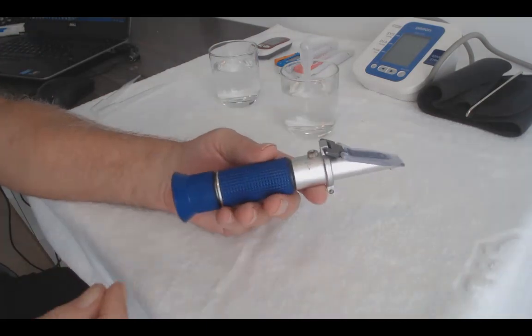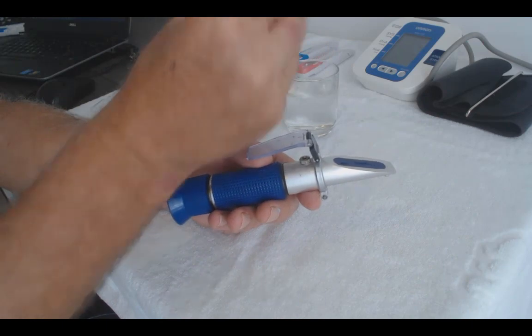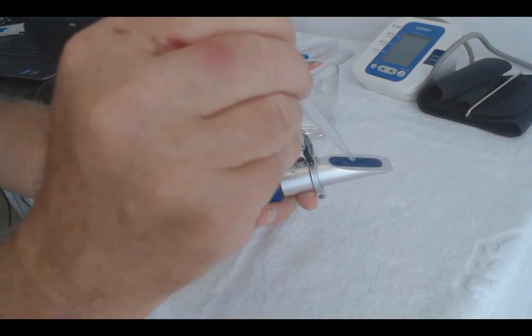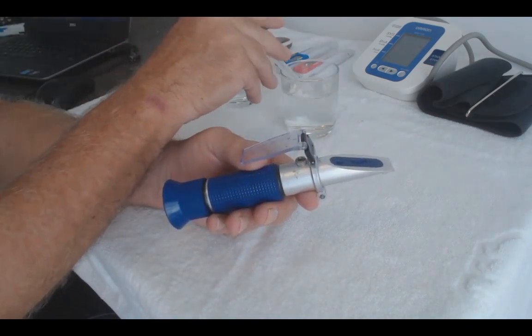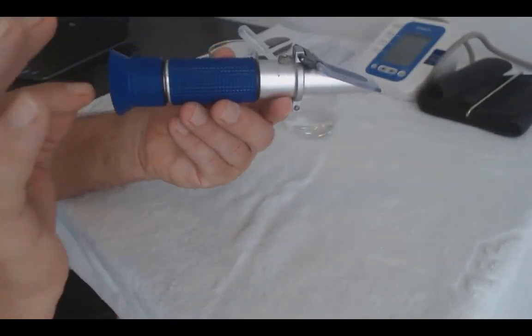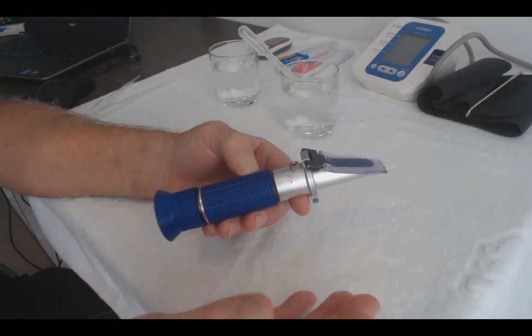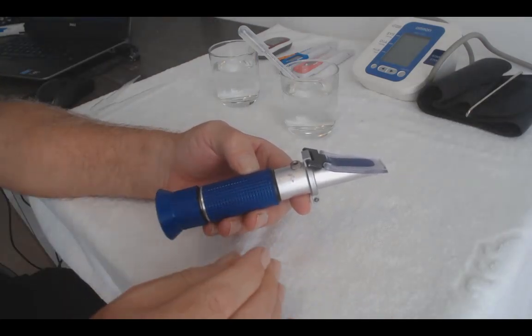Doesn't matter. It's just a simple matter of opening up, taking a sample of the urine, putting a little drop on here, remembering the water has disinfectant in there, of course, closing it off, having a look through, and then reading the brix on the left-hand side. And that's about it with the brixometer. There's nothing else to it.